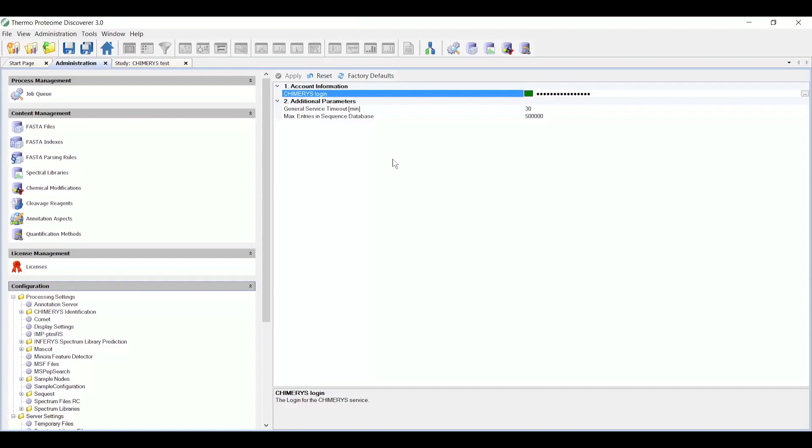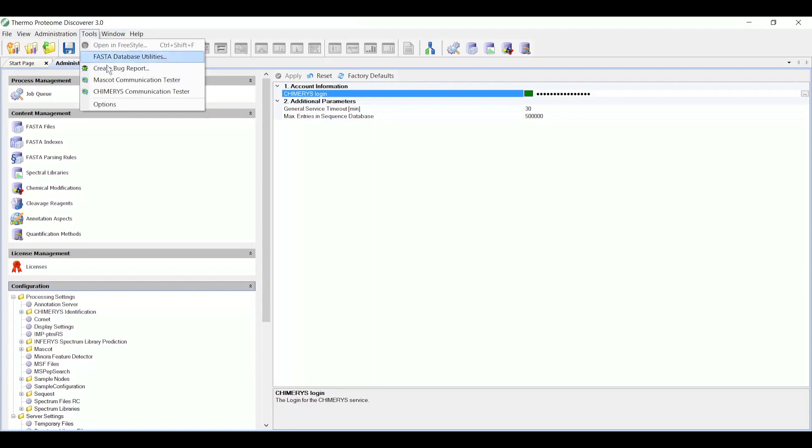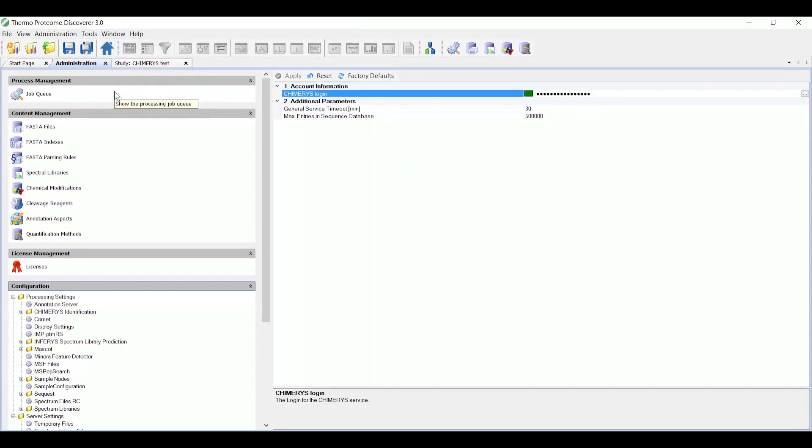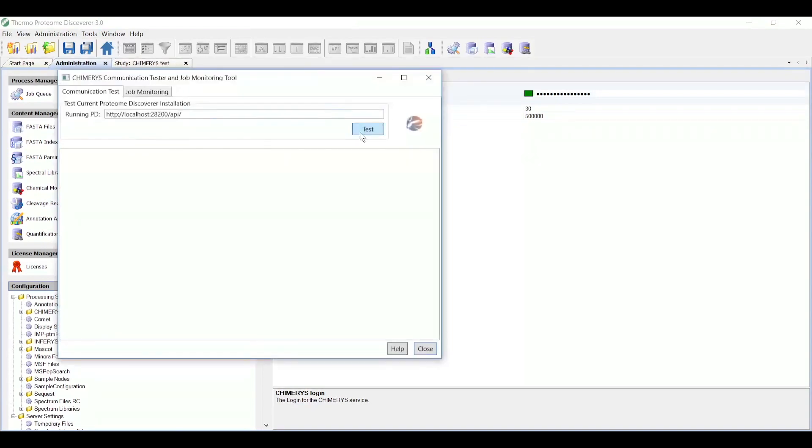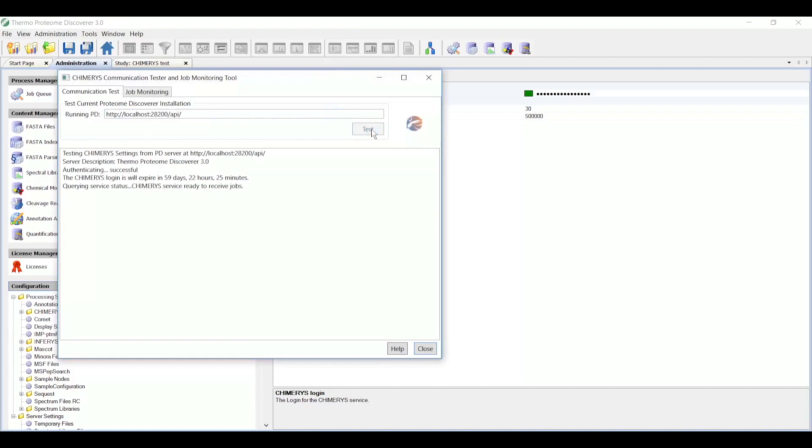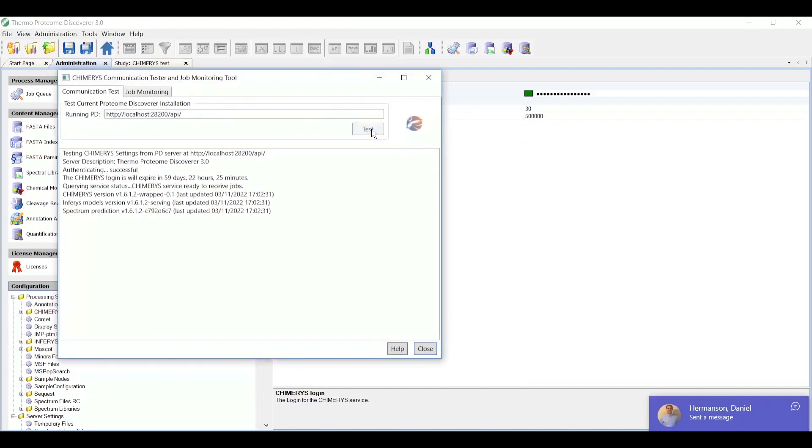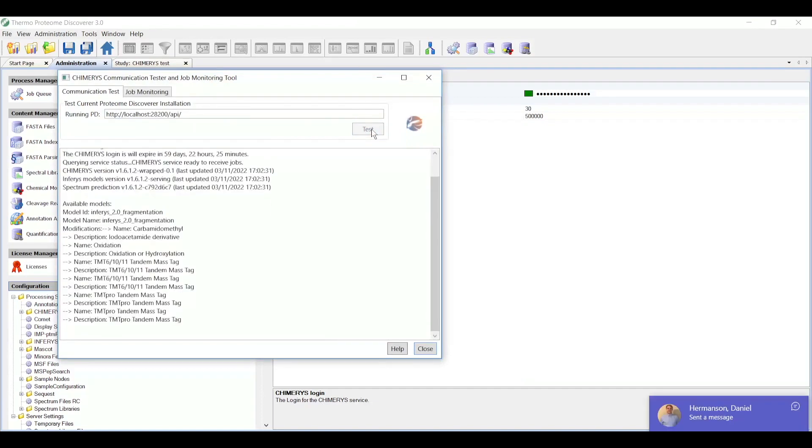You can also ensure that your connection to the service is working well by going to a new utility called the CHIMERYS communication tester available from the tools menu. It'll pop up this tool. You can click a button called test, which runs a quick connection to the service.